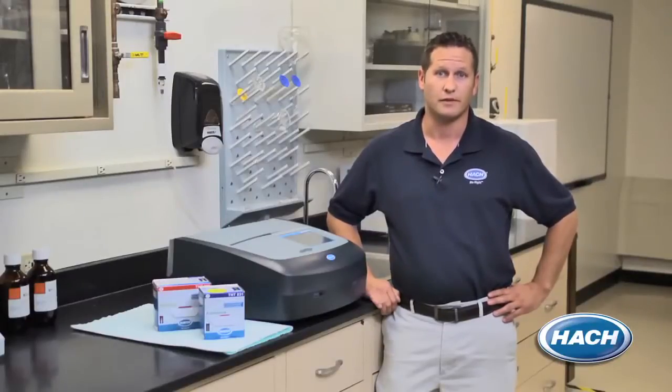Hi, I'm Taylor with the Hach Company. To help you with your water testing needs in the lab, I'd like to spend a few minutes talking about our new DR6000 spectrophotometer. With ultraviolet and high-speed wavelength scanning abilities, over 250 pre-programmed testing methods, accessories for both high volume and high accuracy needs, integrated quality assurance software, and guided step-by-step procedures, you'll see why we consider this the industry's most advanced lab spectrophotometer.